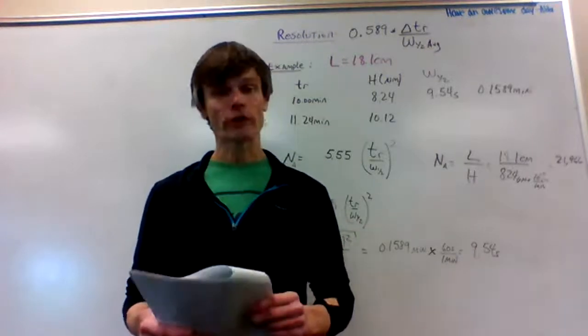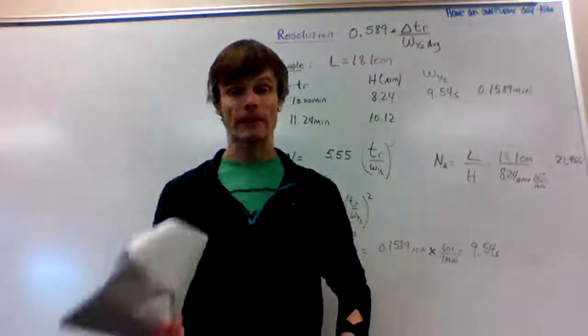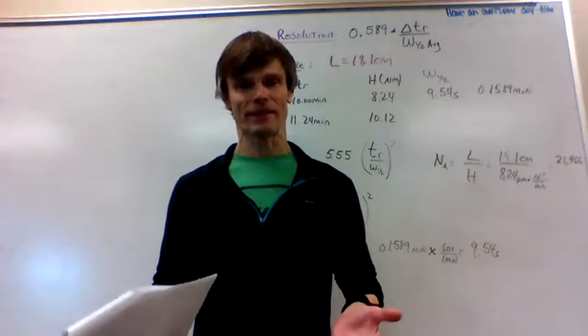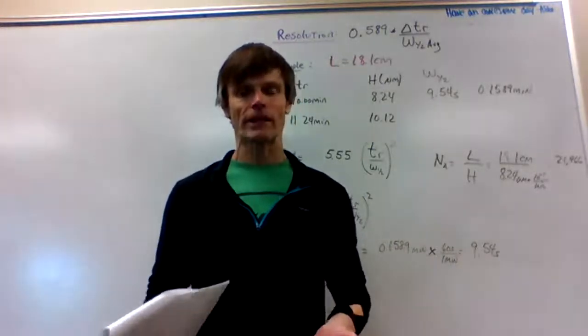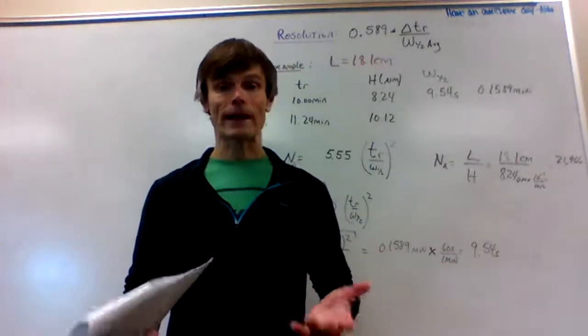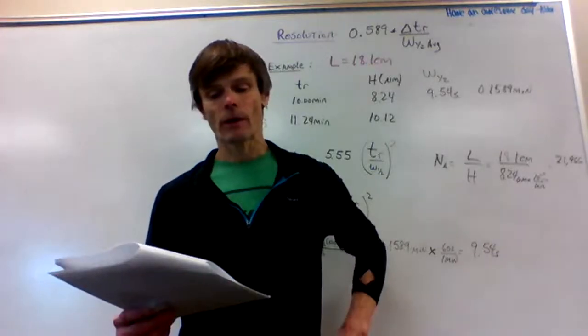In this lecture, I will introduce the Van Deemter equation, and we'll discuss what the Van Deemter equation is. And in many cases, we don't solve it, but we look at the Van Deemter equation to help us understand parameters that we control when we conduct a separation experiment using a chromatographic method.